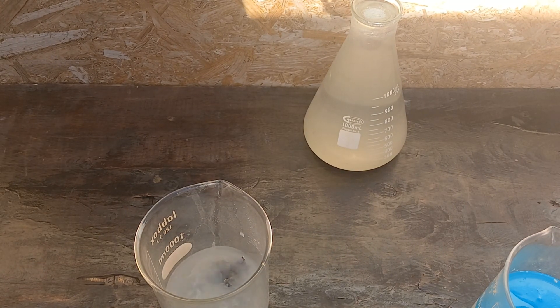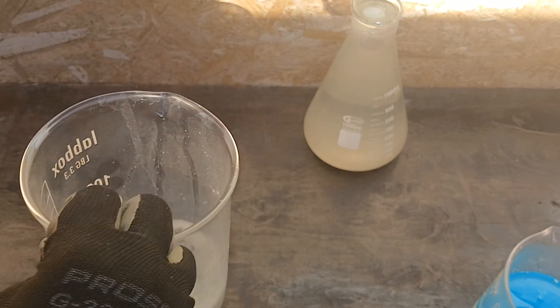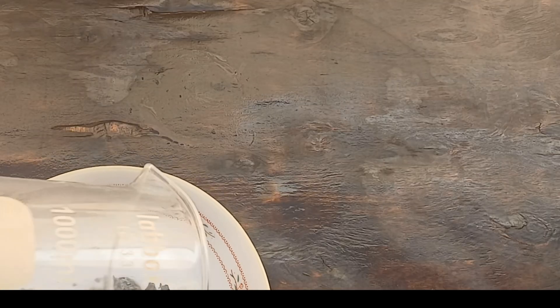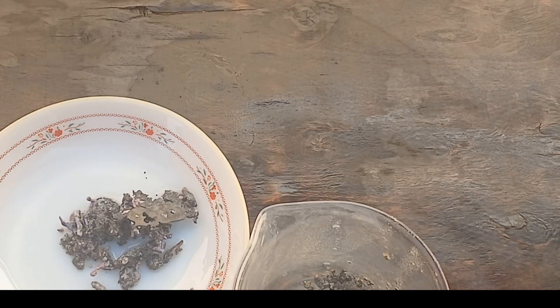We washed it well several times with water until any traces of hydrochloric acid were removed, so that we did not have aqua regia. After that, we add an amount of water and add the same amount of nitric acid.